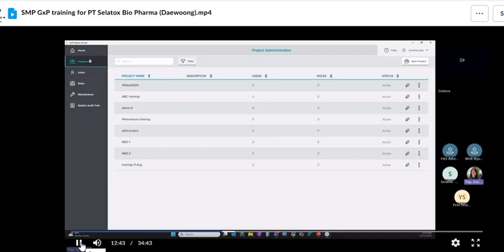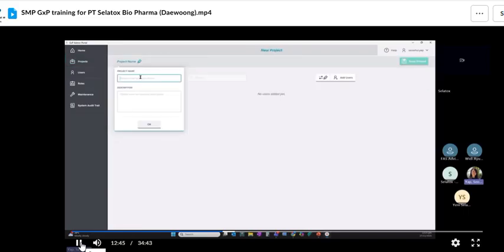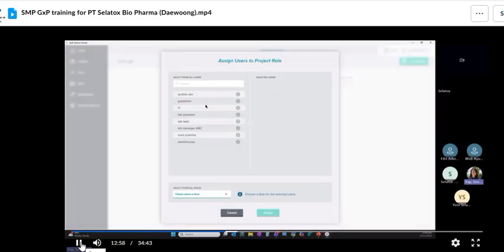Okay, let me show you project. For now, I will create a new project. So let me see, I will create this project. Then I will add user. I want this user, med scientist user, to be assigned the scientist role.